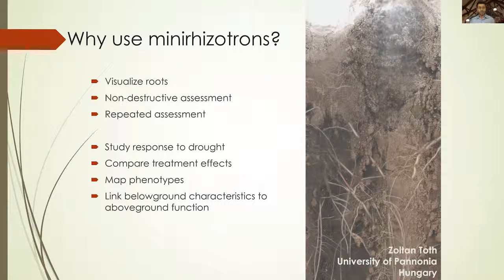So getting back to root study, a lot of studies are actually destructive of the roots, which really makes it hard to visualize the roots in their natural biome, do a non-destructive assessment, see how they grow, and do a repeated assessment over time of growth, application studies, and pathogens. Since their proposal by J.H. Bates back in 1937, Minirhizotrons have been constructed with a successive list of technologies, starting with just mirrors, in order to visualize roots and provide a means to non-destructively and repeatedly assess root conditions.